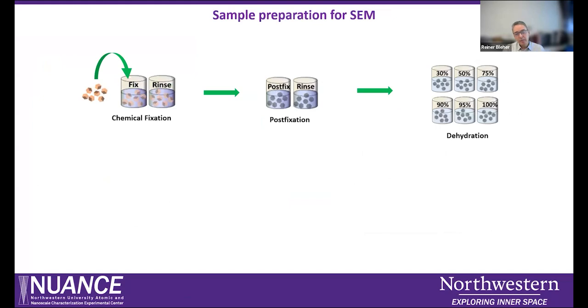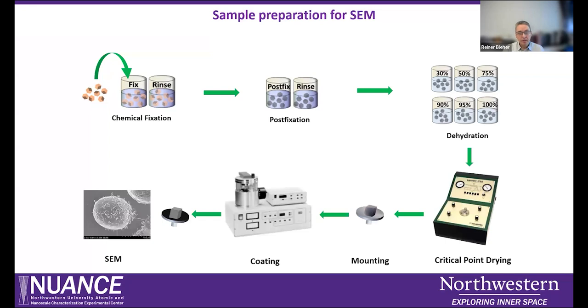For SEM, we have basically the same beginning steps. We do fixation, post-fixation, dehydration, but then we would not infiltrate with resin, but do the critical point drying, mount this dry sample, coat it, and then it would be ready for SEM.